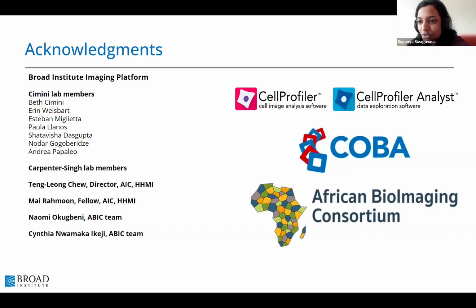With this, I would like to know if there are any questions, or I'll hand it over to Paula, who will be going over the outline of the hands-on exercise that we'll be doing today.